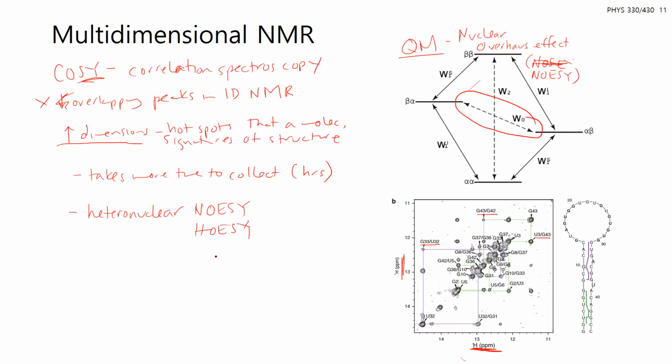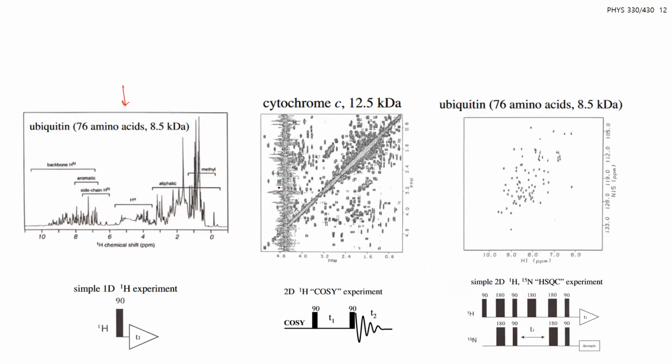And there's also ROESY, which is rotating frame. There's lots of variations. And again, just like many biophysical techniques, there's an alphabet soup of, as you make slight changes, you call it a new technique. So I think this is best illustrated on this slide. Yeah, total correlation, diffusion ordered. Yeah, so you can look at the diffusion, all of these.